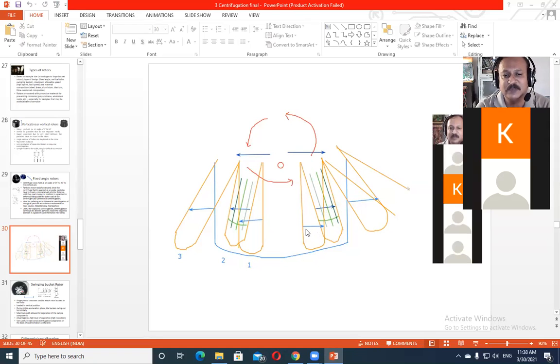Therefore this is often regarded as a more rapid method for the centrifugation of small particles. The drawback is that because the distance is smaller, the resolution is not very good. Particles which are similar in size or density cannot be easily separated from each other. Very often these particles would sediment together at the other side.